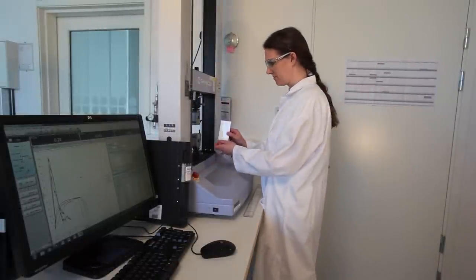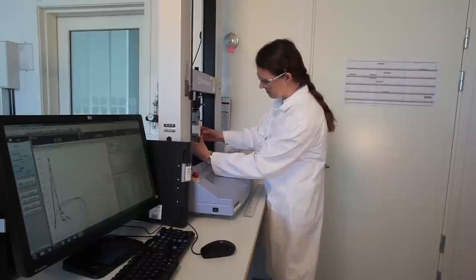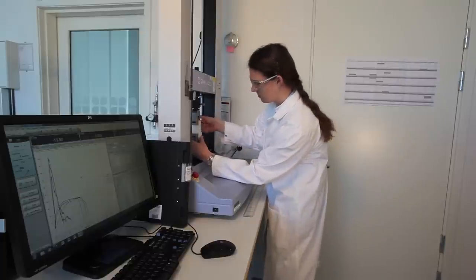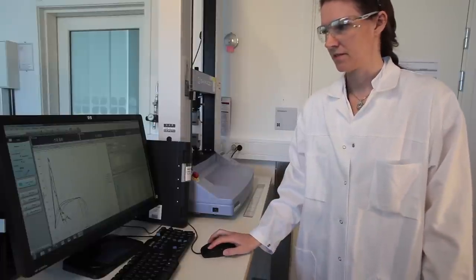We then load the sample between the jaws, making sure it's relatively tight, and then we start the test.